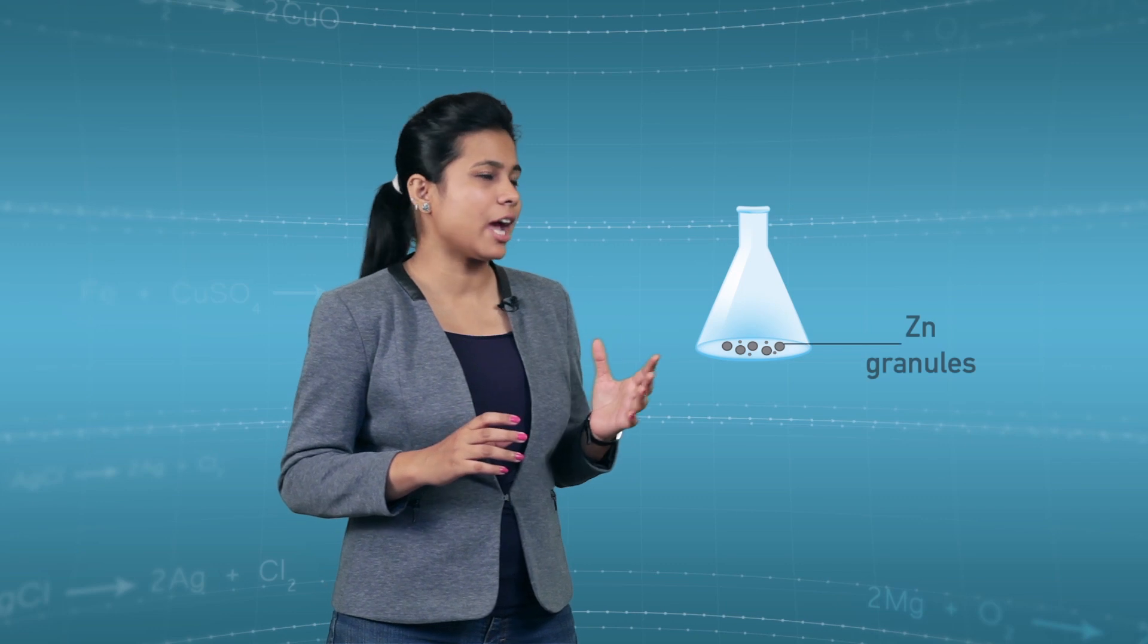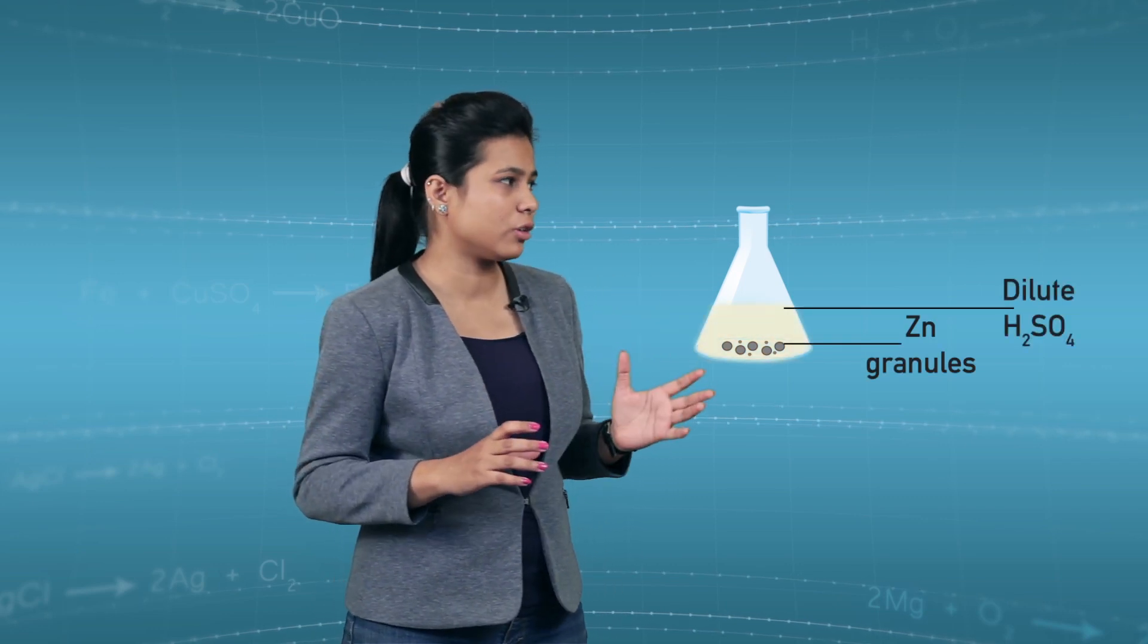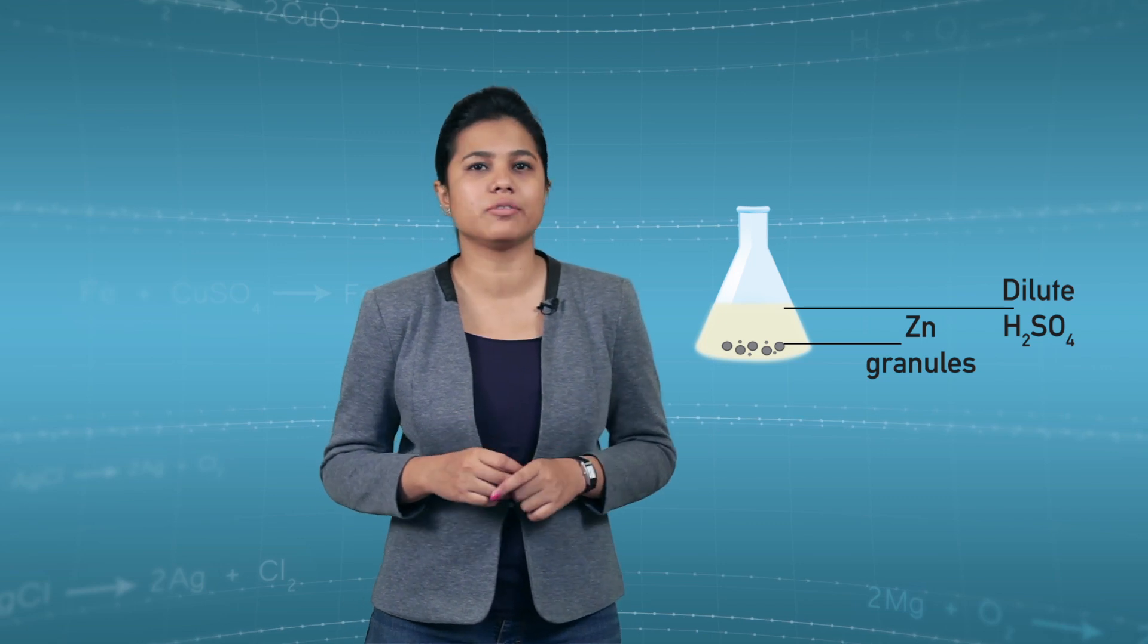We will carry out another experiment to show the change in temperature and evolution of gas. I have some zinc granules in a conical flask. Now I will pour some dilute hydrochloric acid or I can even use sulphuric acid.